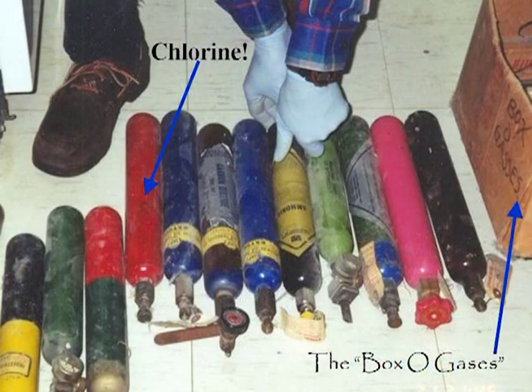We've actually found chlorine gas cylinders in at least 3 or 4 of the schools we've visited, which were planned to be bubbled underwater to form a known concentration. Please, if you absolutely have to have chlorine water, buy it pre-diluted. Let somebody else take the risk of having an escaping chlorine gas entering their school.